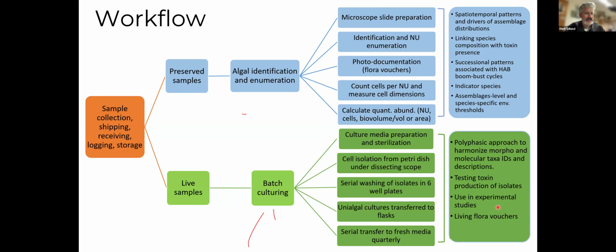Cool. I wonder if cyanobacteria can be more easily frozen and just stored, rather than having to continually transfer. I know diatoms are problematic in that way, but I wonder if cyanos could do it. No, cryopreservation for cyanos is pretty common. Good. So that's probably something I need to start looking into because I can't keep doing the serial batch culturing transfers. It's a lot of work. And Matt from UTEX has weighed in. Thank you, Matt.